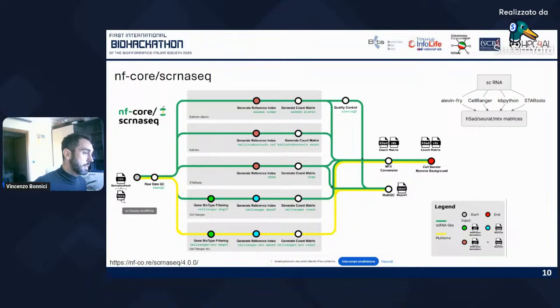So we start from the FASTQ files that are the reads, paired with the quality of the reading, and then we pair them with a CSV text file that informs us about the sample. That is the sample sheet. It informs us about what we did in the experiment. So we have a kind of raw data. We run FastQC as usual for any type of sequencing in order to filter and to visualize the quality of the reads, and then we can start with our analysis.